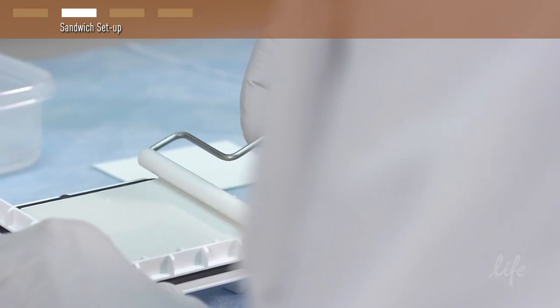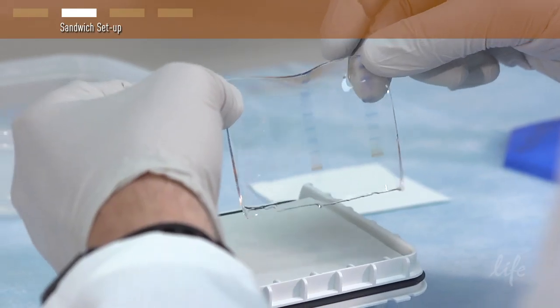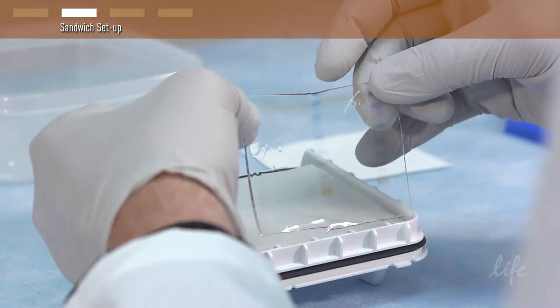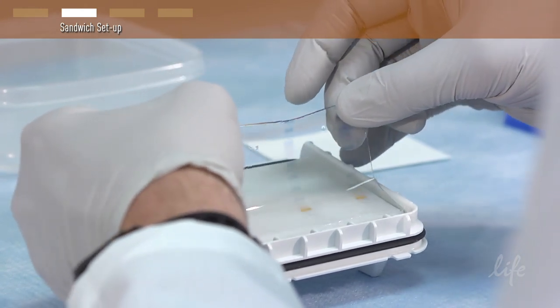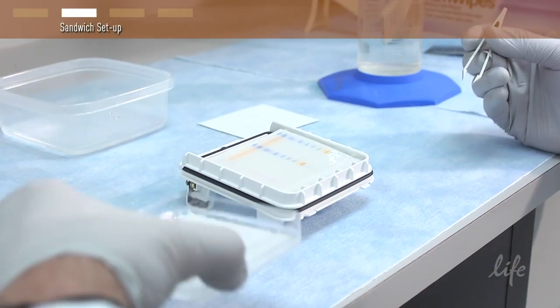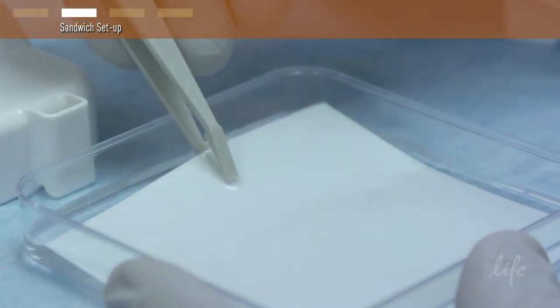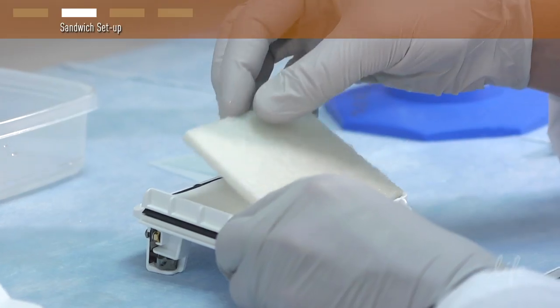Next, use the blot roller to squeeze air bubbles out between each layer. Place the gel on the stack using the roller again to remove air bubbles. Using the tweezers, place the membrane on top of the gel and roll to remove bubbles on the stack.